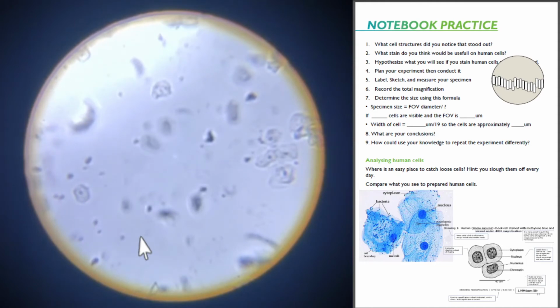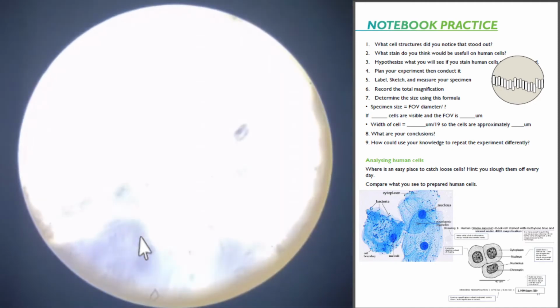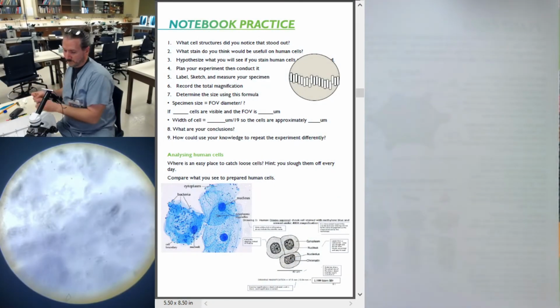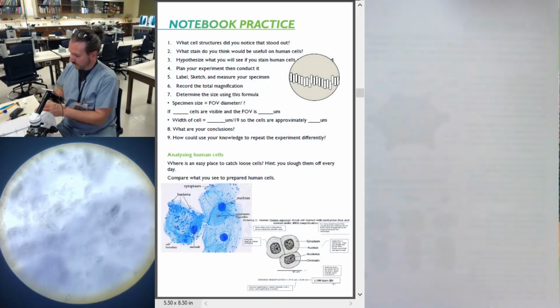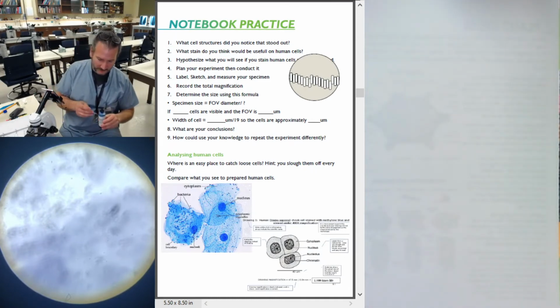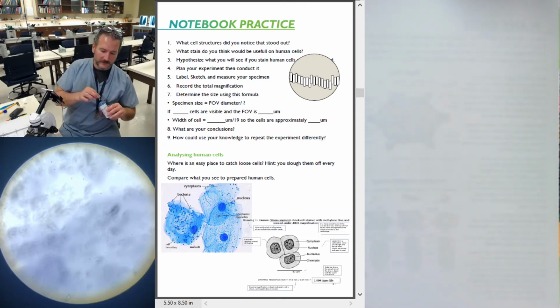Okay, now I'm going to take methylene blue and do the same thing we did before. Come off of this. So I have some toothpicks. I'm going to grab a nice clean toothpick. Open my methylene blue. Always make sure I know where that's at. Very messy. A little drop there at the tip.